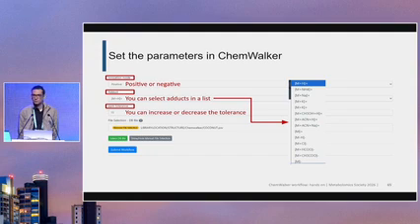But ideally, you set it to 0 and do the whole screening of all the matches. That's one of the reasons I mentioned the restart session for the analysis, because then you can set a different threshold. For that one, we used 50,000 because we already knew one of the drugs was present there.